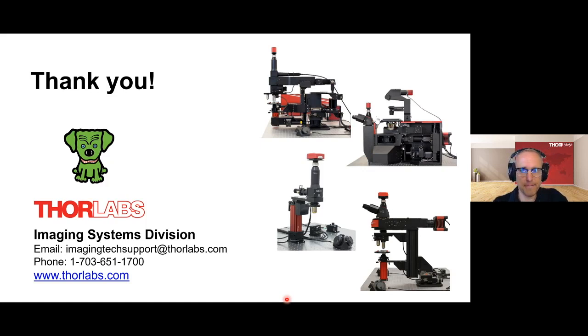Now, the next question is practically how to exactly conjugate the objective focal plane with the detection pinhole. Right. You mean how to place the pinhole so that it lines up with the image plane, so that it's in a conjugate plane to the image plane? I assume so. I've never done this myself directly, but I would imagine it's going to be at the focal point for that pinhole lens, right?